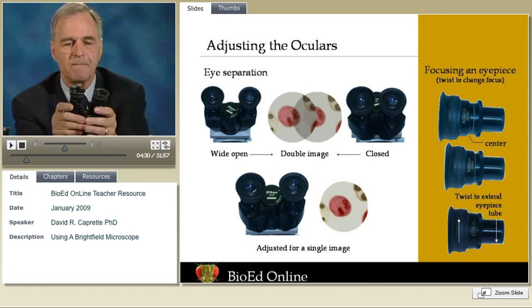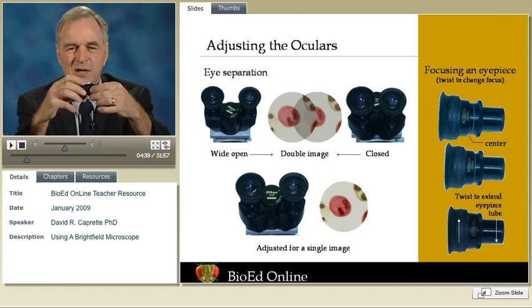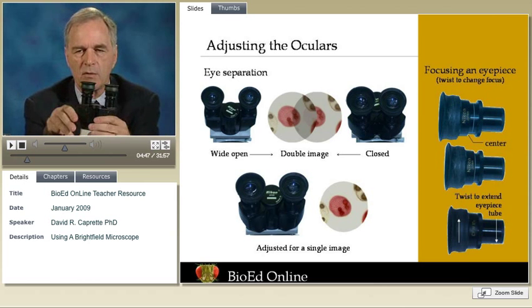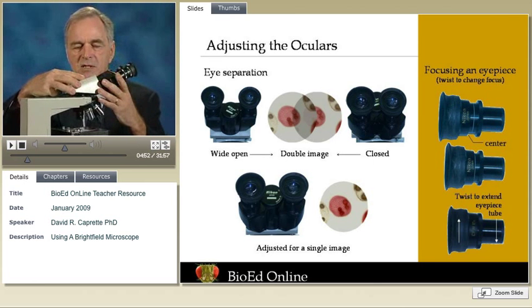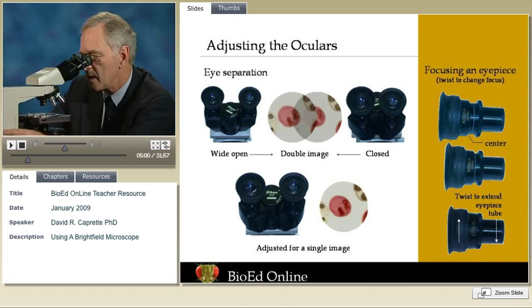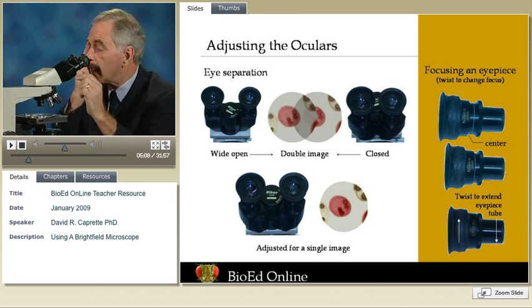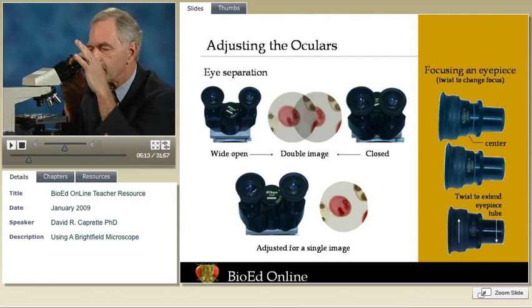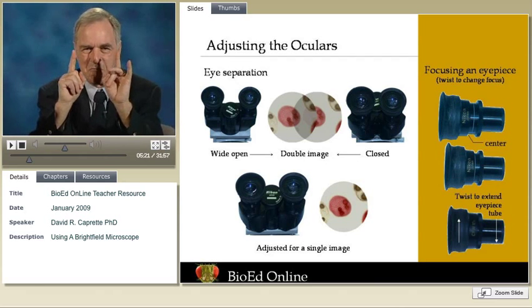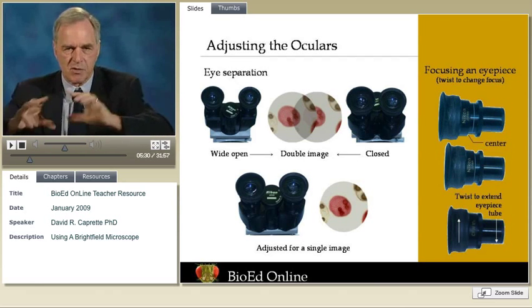This particular binocular eyepiece tube has two oculars that are removable and both are adjustable. You can take the eyepiece and telescope it by twisting to give it a focal range. That's important because what we want to do is focus the microscope. I'm going to focus the microscope by looking through just one eye — and there we go, I'm on the specimen. Now I look with the other eye, and it's a little off. So I take my eyepiece, leaving it in place, and focus the eyepiece itself. When I do that, I've got the eyepieces matched for both eyes. Now it doesn't matter what objective lens I use — I see a nice, clean, crisp, focused image just by focusing the microscope itself.